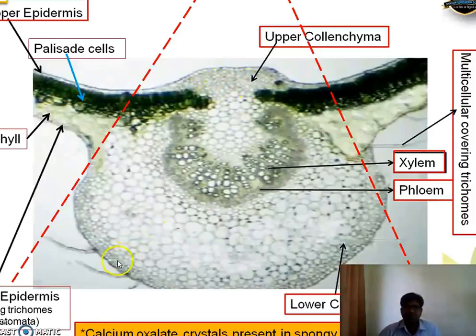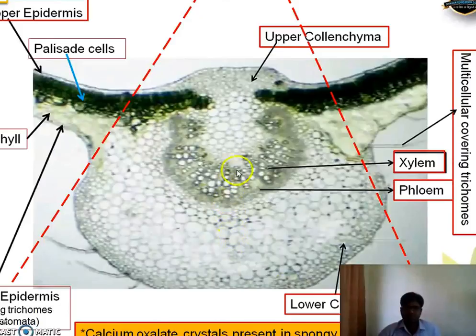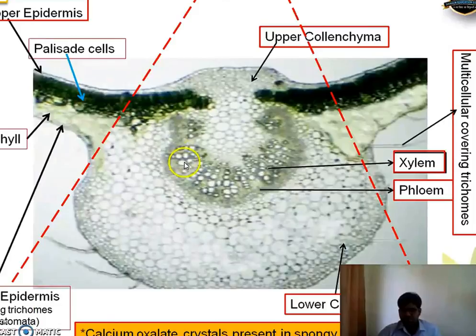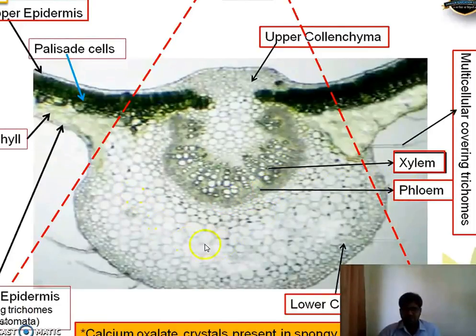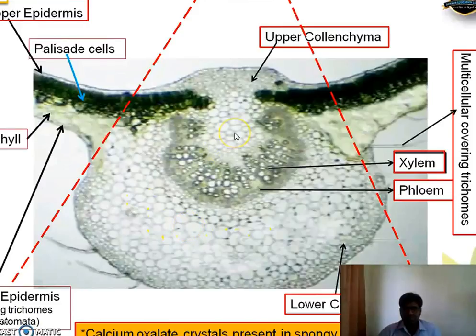There are three to four layers of collenchyma on both upper and lower sides performing mechanical support. At the center, the large hole-like circular structures are xylem vessels, responsible for conduction of water — they are lignified and give pink coloration when stained with phloroglucinol HCl. The smaller cells are sieve tubes, part of the phloem responsible for conduction of food. The remaining large polygonal parenchyma cells are spongy parenchyma. These are the general parts.